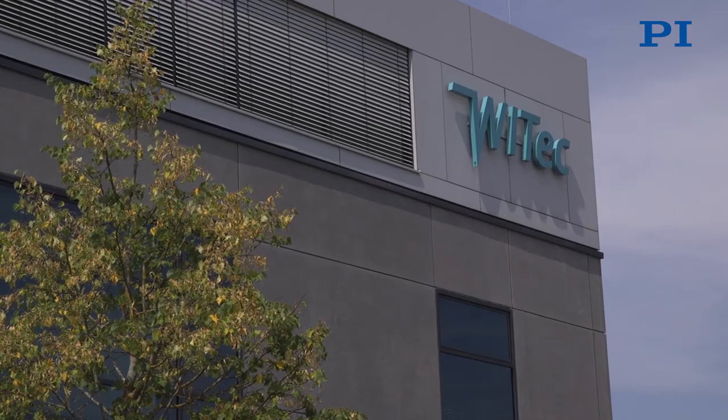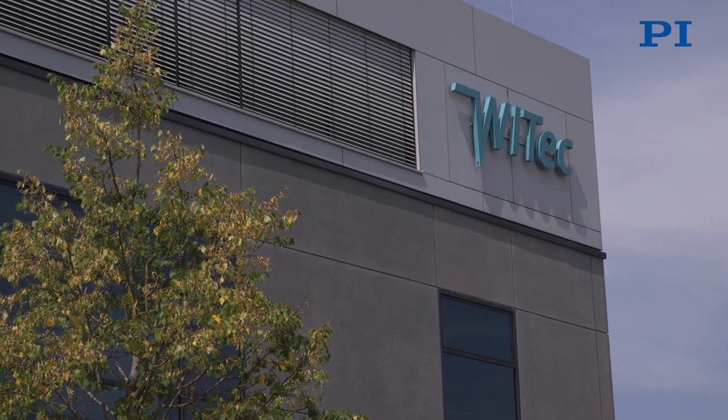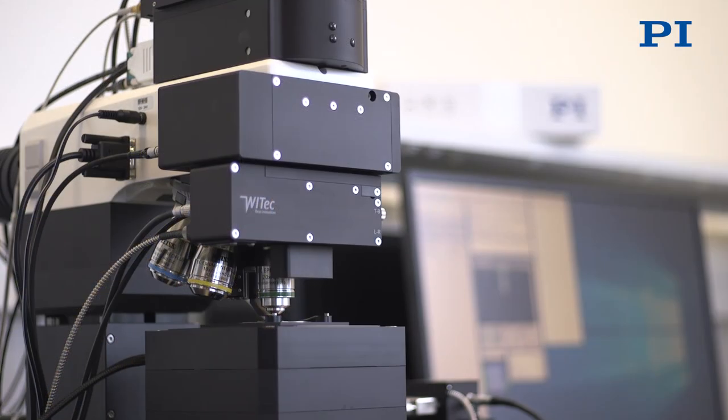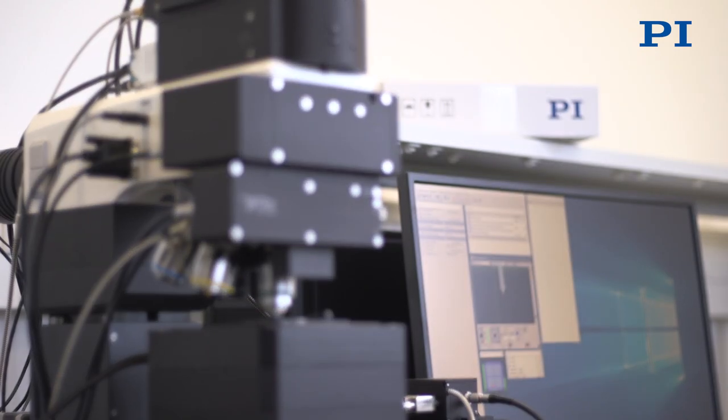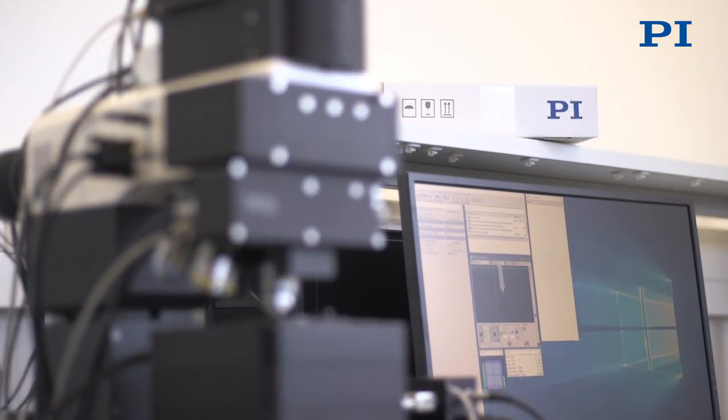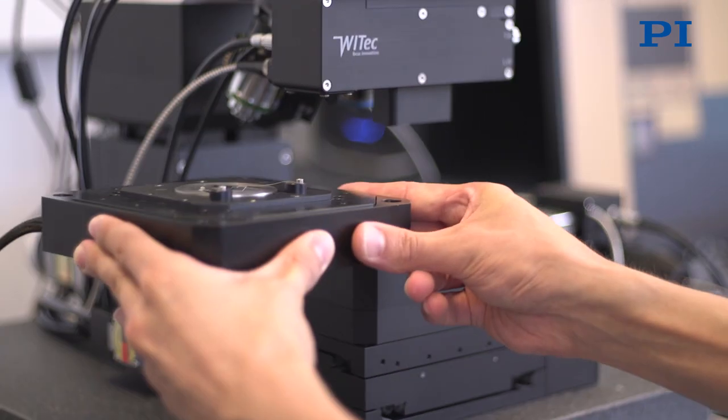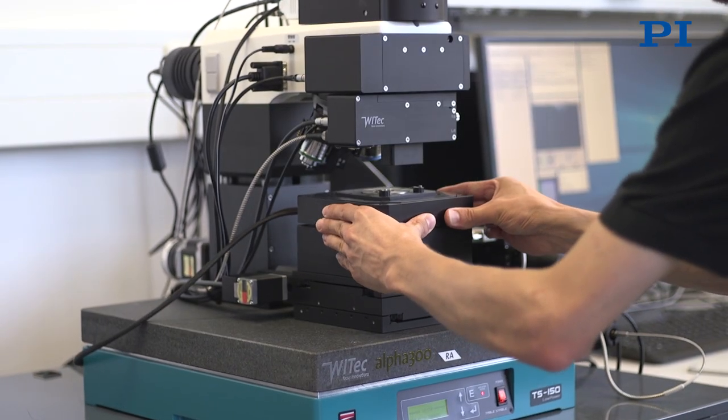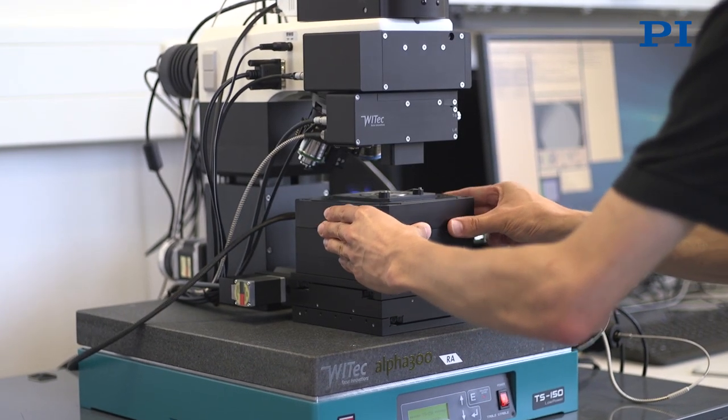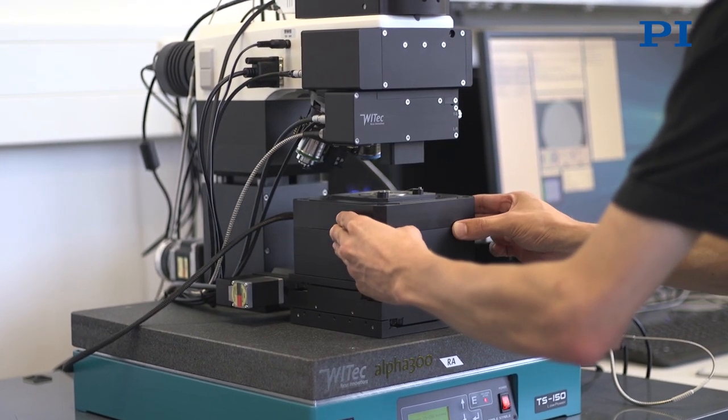WITec has been in the business for 21 years and has had a business relationship with PI for just as long. We use piezo scanning stages from PI in our systems.